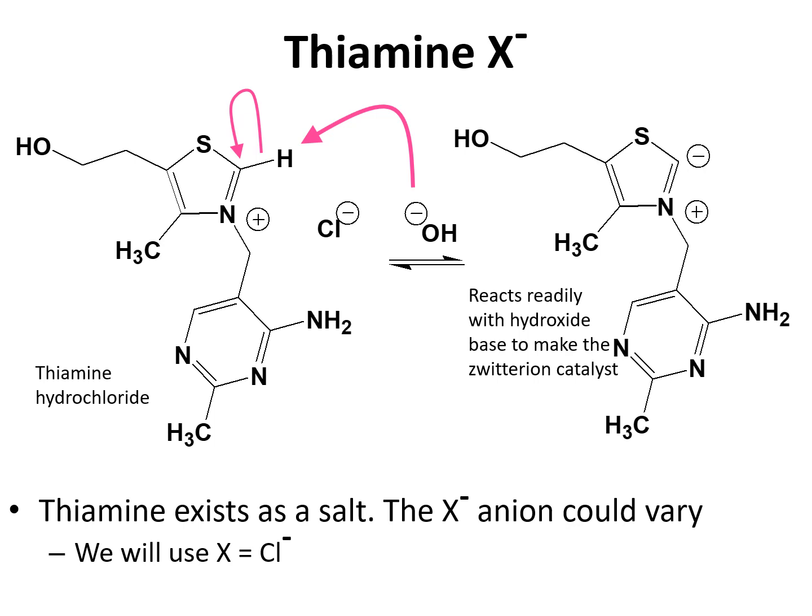The thiamine we use is thiamine hydrochloride, and thiamine is a nitrogenous base that has a plus sign from before.